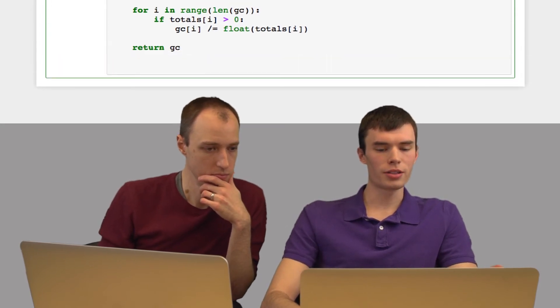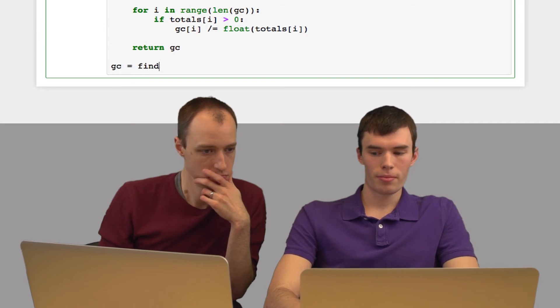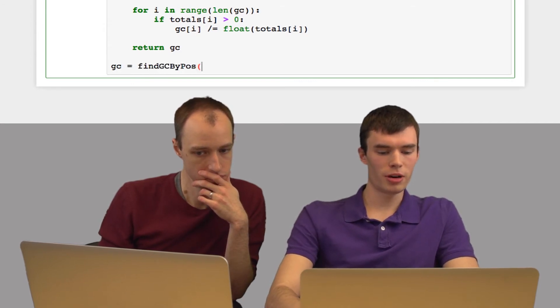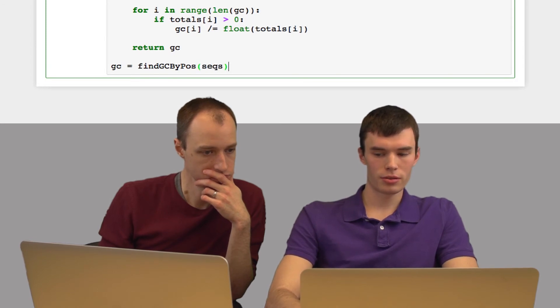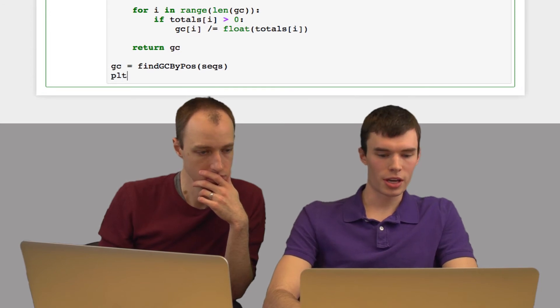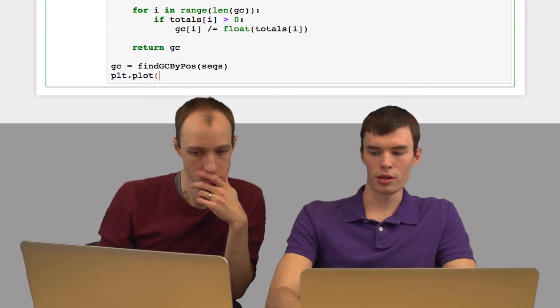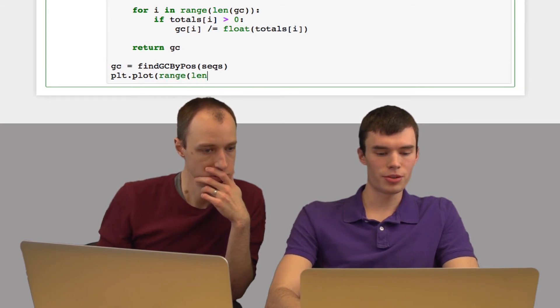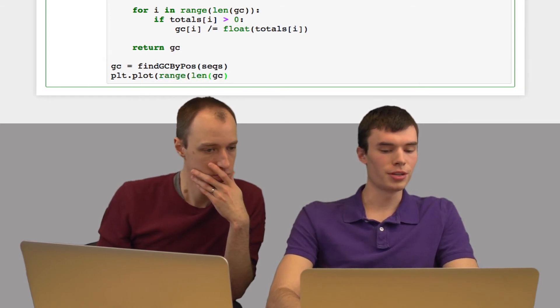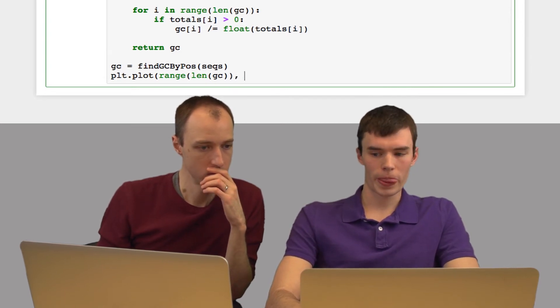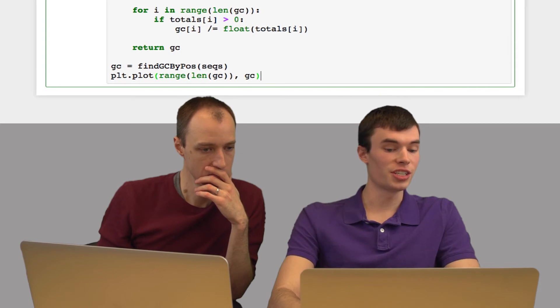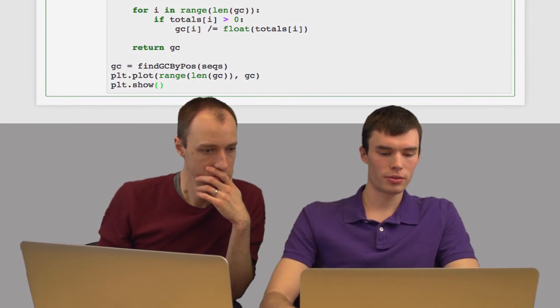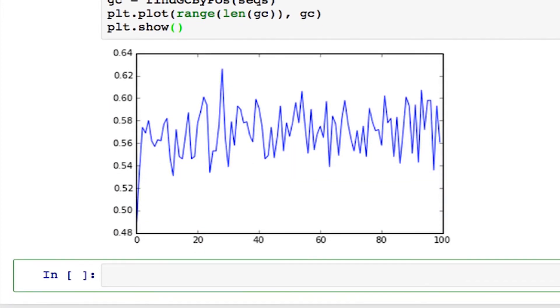Now let's run this function on our set of reads: findGCByPosition on our sequences. I'll use matplotlib to plot this as a line plot. For the x values, I'll use numbers from zero to the length of the read—the indices in the sequence. I'll plot the average GC content, then do plt.show. And here's our plot.